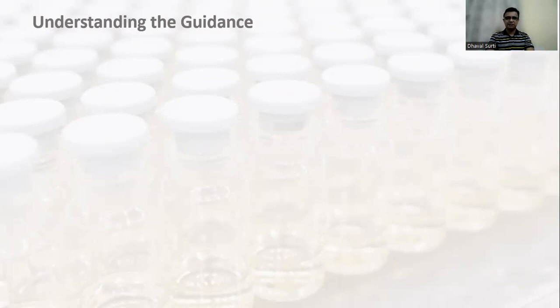In my previous video, we discussed how to perform media fill for lyophilized products, and that was prepared halfway. I discussed various topics with respect to the guidance for industry and EU Annex 1. Let us continue with more exciting guidances and more exciting examples, which will help you better understand how we can simulate media fill for the lyophilization product. So let us move ahead with the guidance part again.